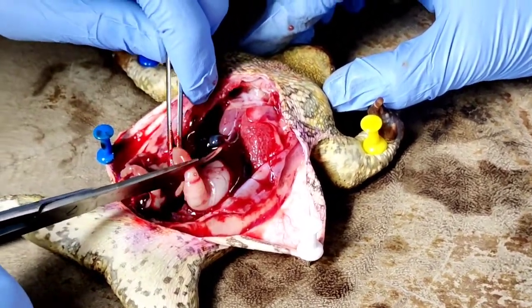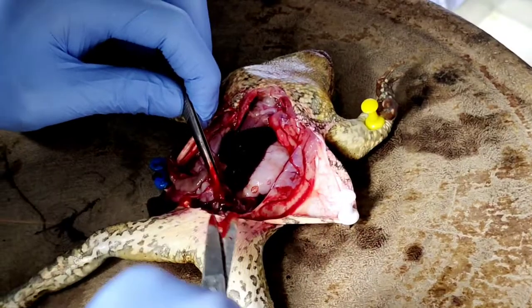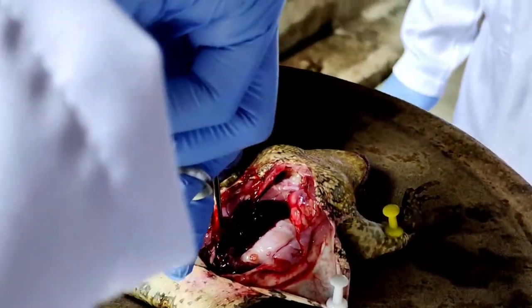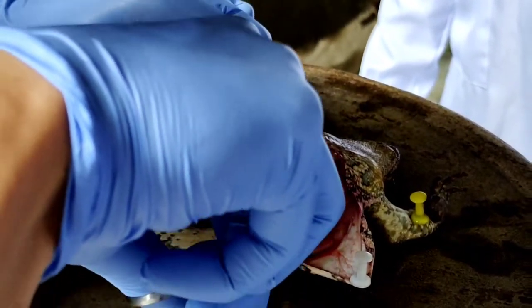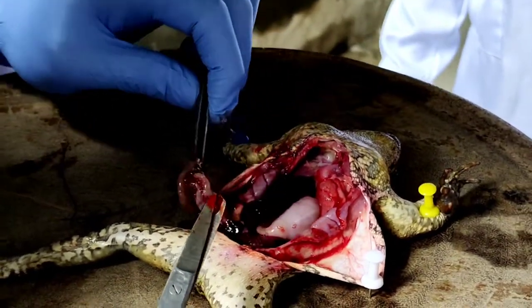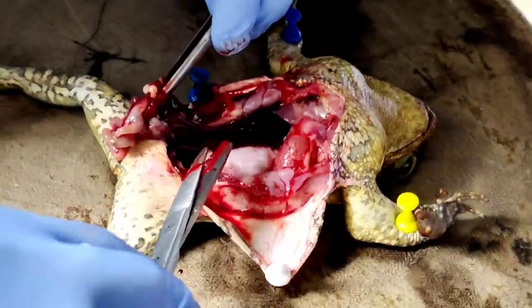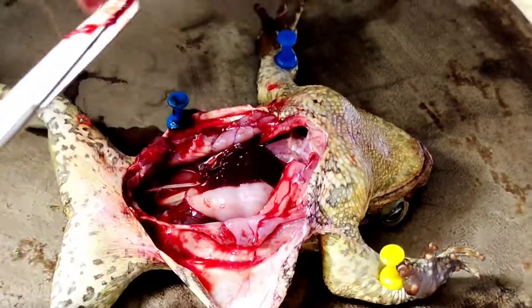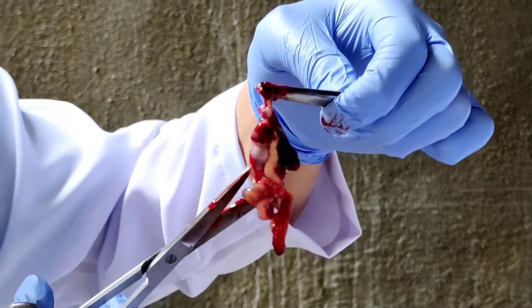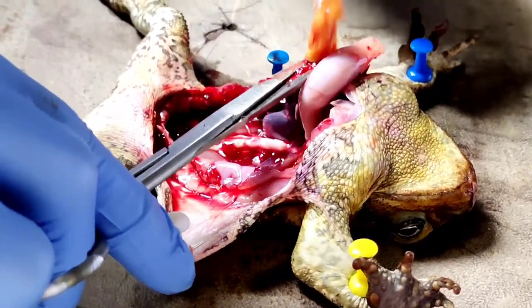Next, we made a cut between the small intestine and stomach to separate the two. We began extracting the urinary bladder along with the large and small intestine, as well as the pancreas. There were more fat bodies inside, so we quickly took them out.